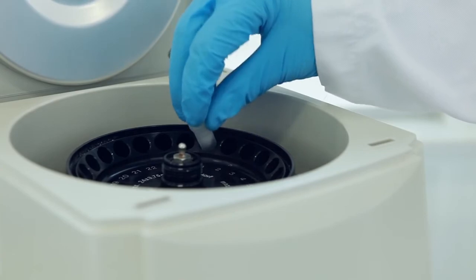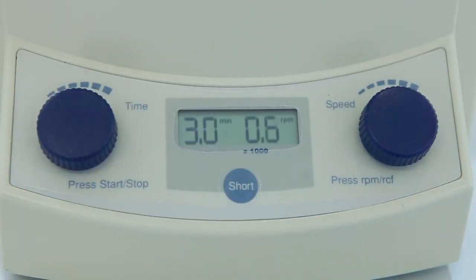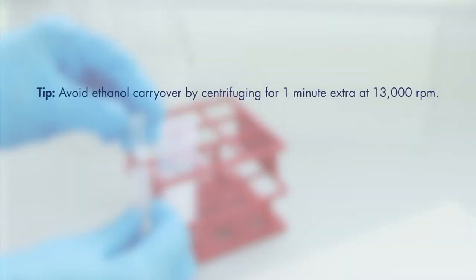Centrifuge for 3 minutes at 13,000 RPM. Discard the flow-through and collection tube. For optimal results, to avoid unwanted ethanol and salt carryover, discard the flow-through, reuse the collection tube, and centrifuge for a further minute at 13,000 RPM. Make sure that buffer AW1 is added before buffer AW2. Buffer AW2 should be used at room temperature.